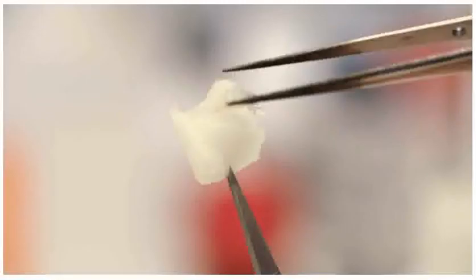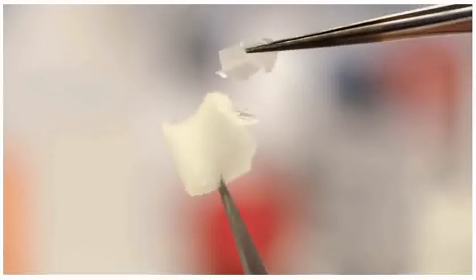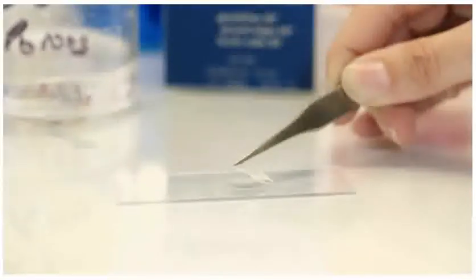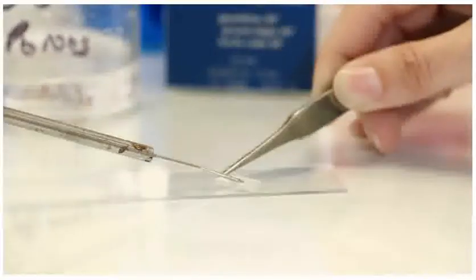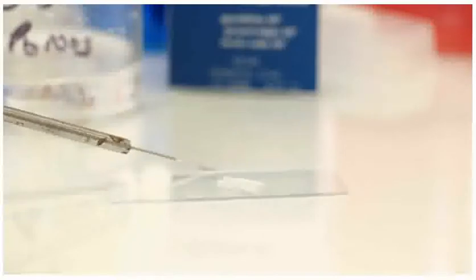A drop of water is placed onto a microscope slide. Forceps are used to gently separate the epidermis from the onion. The epidermis is carefully placed onto the slide over the drop of water. A mounted needle is used to help flatten out the epidermis and push it onto the drop of water.